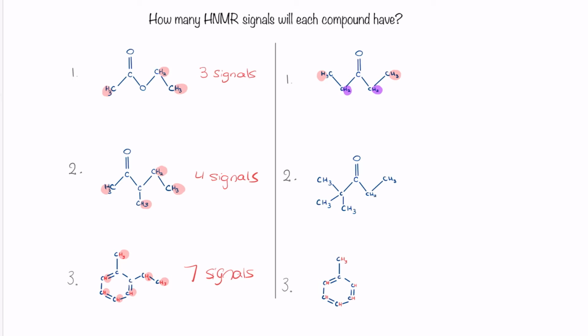Well, if we look at the molecule, we see that there is a plane of symmetry going down the middle of it. This particular hydrogen environment is no different than this one, and that's because these 3 hydrogens have the same exact connectivity as these 3 hydrogens. Both of them are attached to a carbon that's attached to a CH2 group and attached to this carbonyl group. Likewise for this guy, these 3 hydrogens are attached to this carbon, which is attached to a CH2 group, which is attached to a carbonyl group. And so because they're attached to the same things, they're technically the same hydrogen environment.